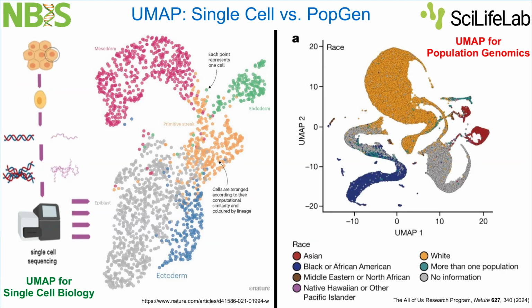Hi, I just wanted to ask you, this is probably a very naive question. Have you seen if the t-SNE clusters and the UMAP clusters are conserved, or do you get completely different results if you compare one set of data from the other? So you mean how comparable a t-SNE plot and a UMAP plot are? I would say if you have enough data points, they are very comparable.